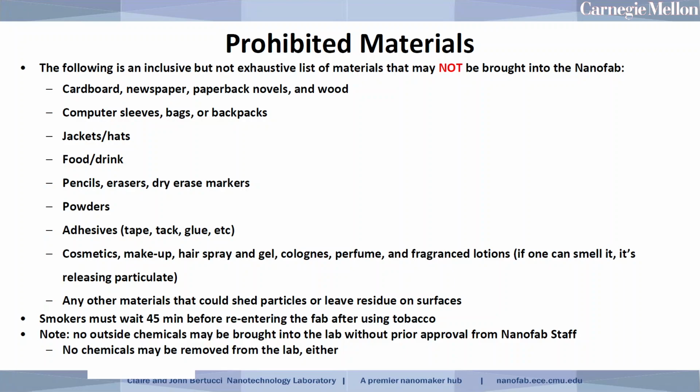No food and drink should be brought into the lab. There is a water fountain in the gowning area for users to use to stay hydrated, but in general, any food or drink should be left outside the lab. We have to be careful about our choice of writing utensils, so we don't want to bring in pencils because graphite and erasers and things like that are going to shed a lot of particles, as well as dry erase markers. We do have writing utensils throughout the lab, so regular Bic pens are fine. We don't really regulate anything outside of what's listed in that bullet point, we have Sharpies and things like that in the lab as well.